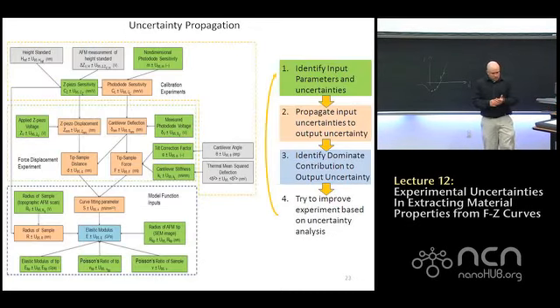For the specific AFM experiment we're talking about, we can consider the data reduction equation I was showing earlier as looking something like this. We have a collection of what I've defined to just be input parameters: our sensitivities, our calibration, so C_Z, M, K. Sorry about that.